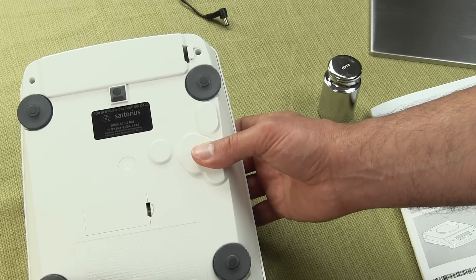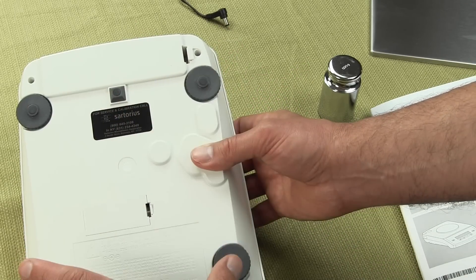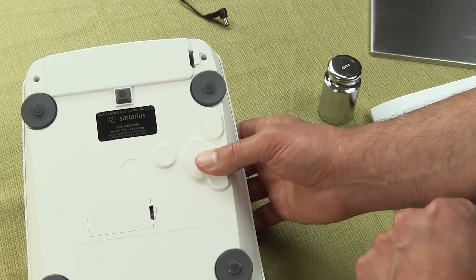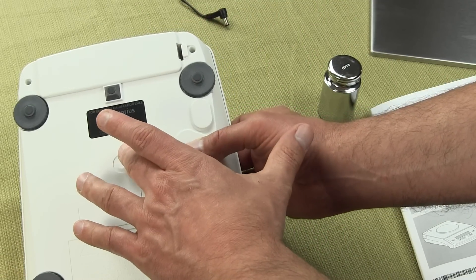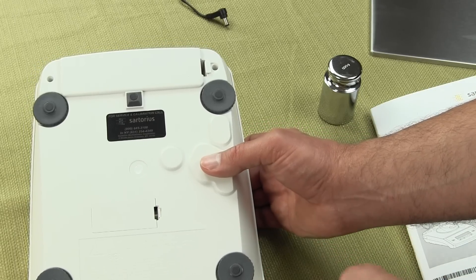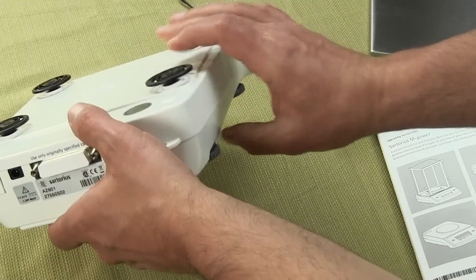The scale also has four adjustable feet. Some models come with two — if they only have two, it's going to use the center post for keeping the rear of the scale stable. There is no below weigh underhook feature. This is a basic scale — Sartorius's entry level model. That's the bottom of the scale.